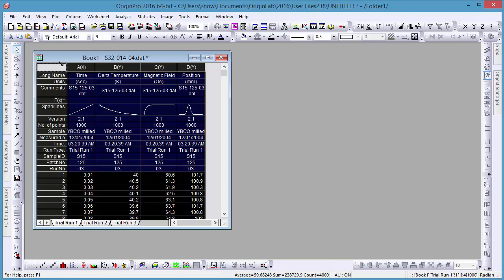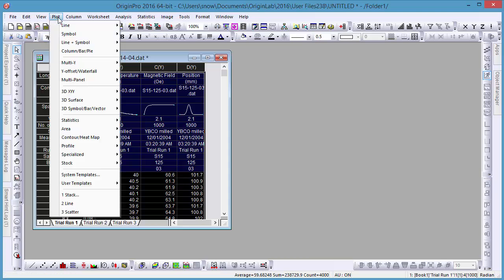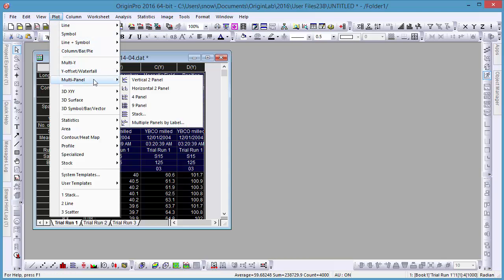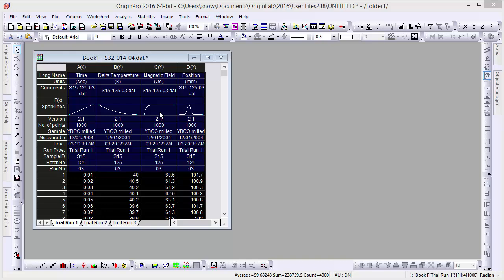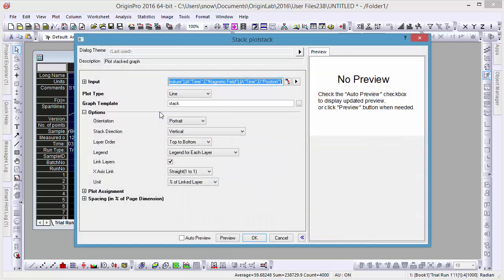Selecting the whole of our worksheet, let's plot our three Y-series as stacked graphs with a common X-axis. Let's modify the layers on one of these graphs.